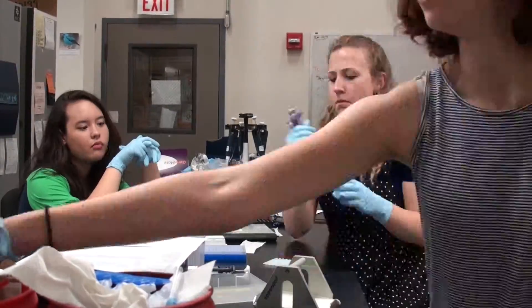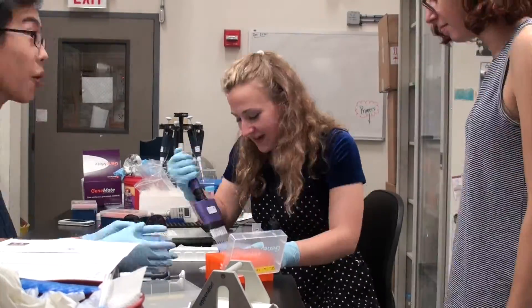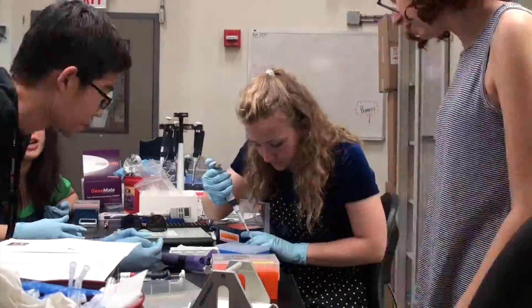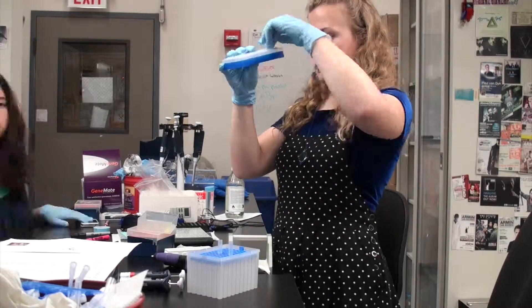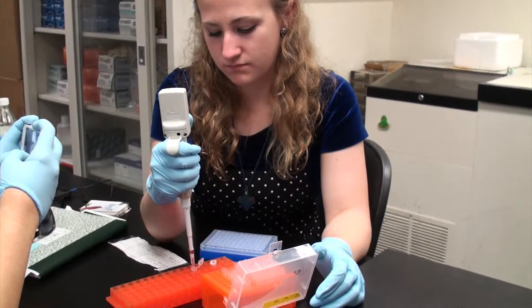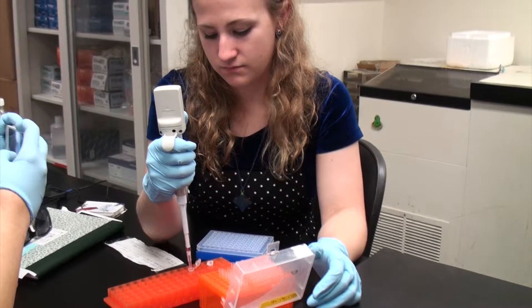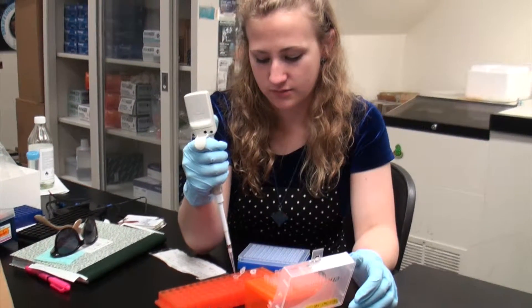After that's done, we heat our plates for 15 minutes to make sure everything is fully evaporated and we're not adding anything extra when we go to add the HiDi. Once those are done, we can add HiDi, which allows the 3730 to read the sequences.